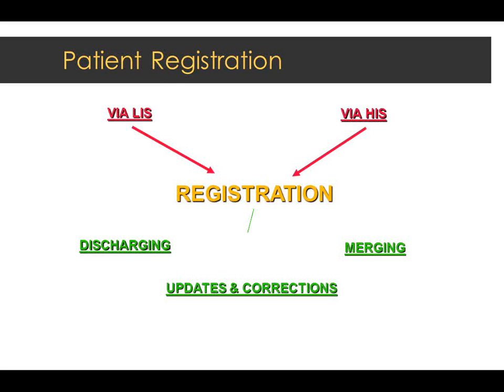I also need to get patient data out of the system. So I need to be able to discharge patients out of the system. And I think we're set up for a year now. Is it a year of no activity that we ought to discharge a patient? Or is it 2? Remember. Yeah, I don't remember either.